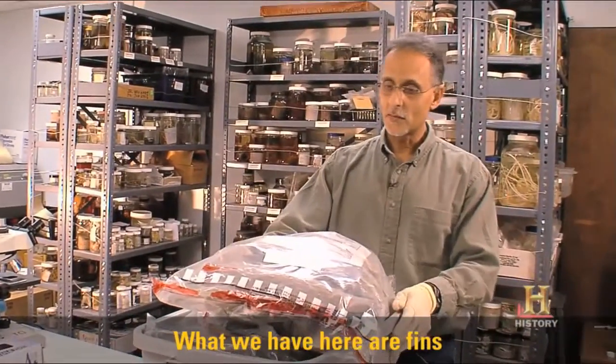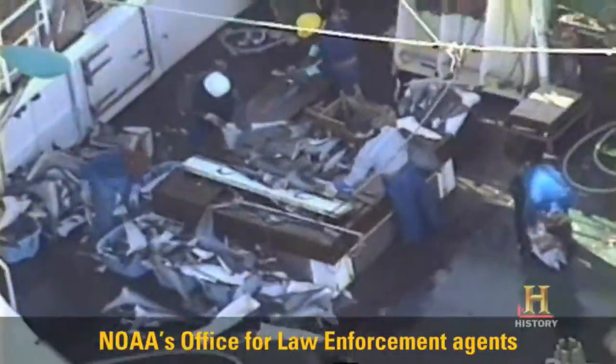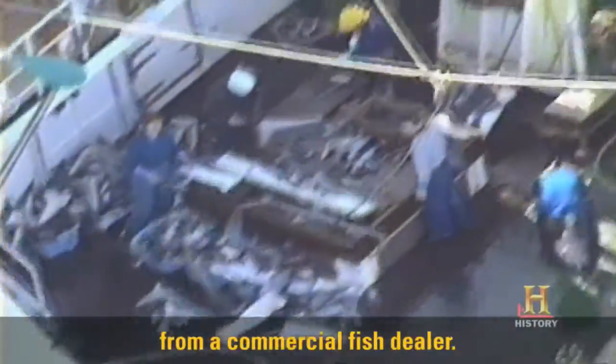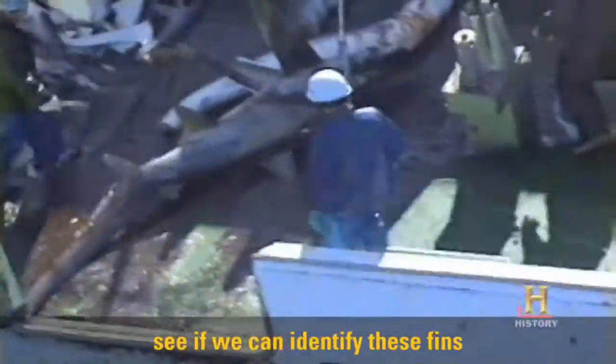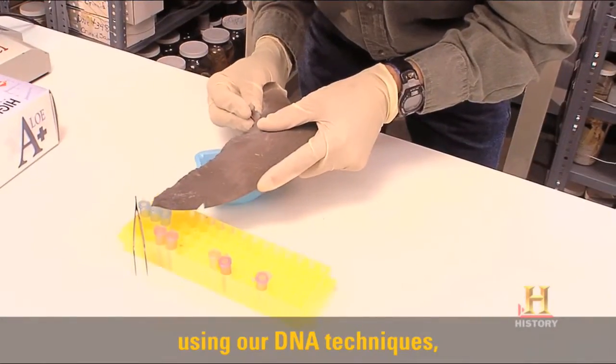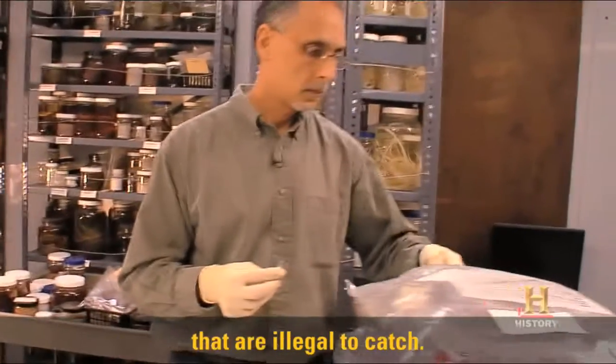What we have here are fins from over 400 sharks that were confiscated by NOAA's Office for Law Enforcement Agents from a commercial fish dealer. They've asked us to see if we can identify these fins using DNA techniques, because they want to know whether some of these fins come from species that are illegal to catch.